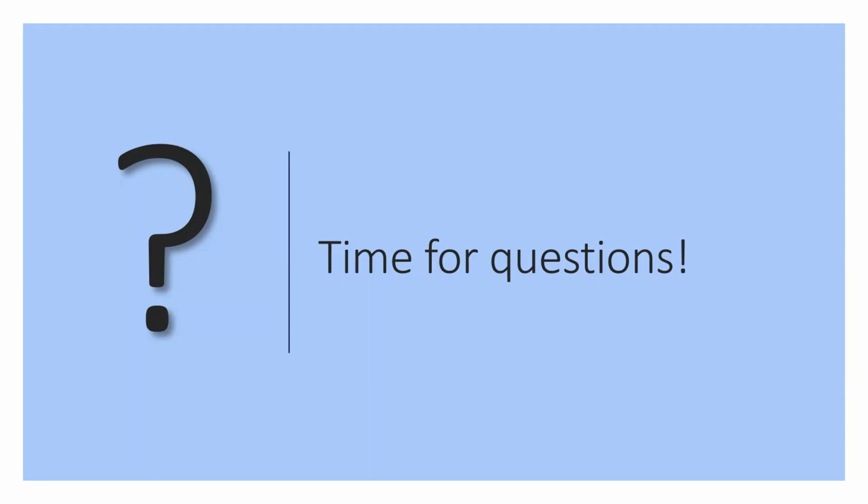How to modify, okay, so this is a good question. Column templates cannot be modified manually. What needs to be done is, if I have created a template and I would like to change it, I will have to click on Manage, delete the old template, and then save it again.